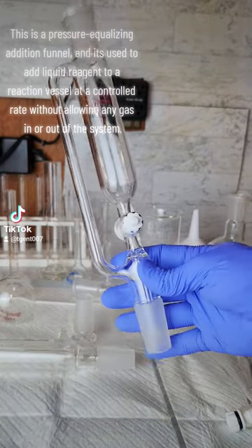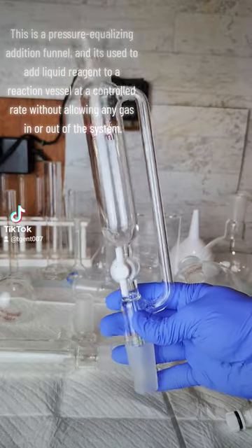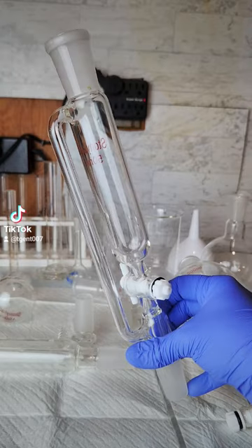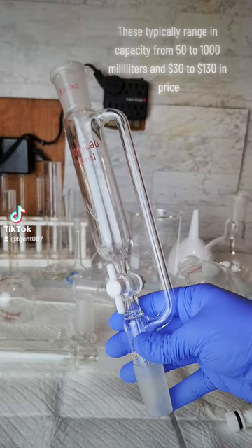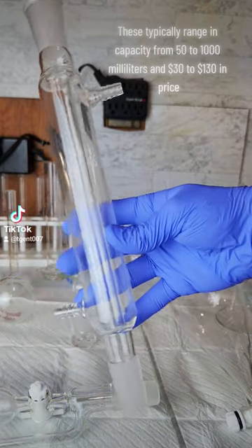This is a pressure equalizing addition funnel and it's used to add liquid reagent to a reaction vessel at a controlled rate without allowing any gas in or out of the system. These typically range in capacity from 50 to 1,000 milliliters and $30 to $130 in price.